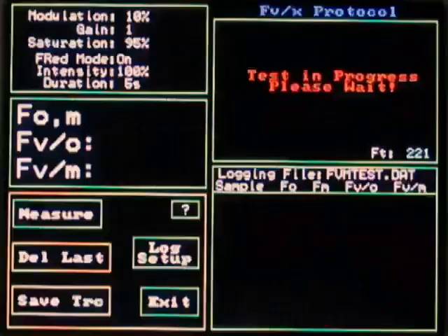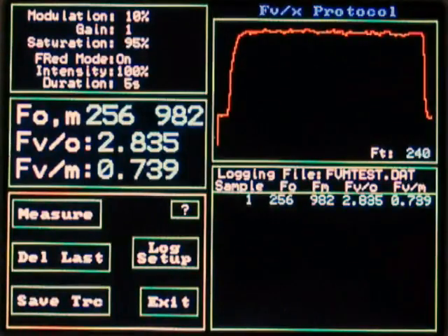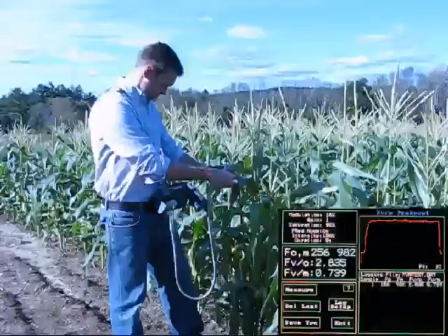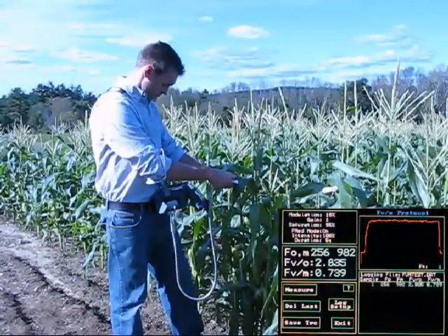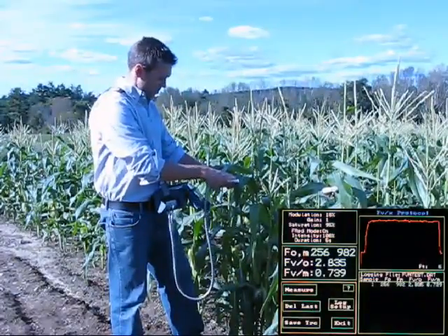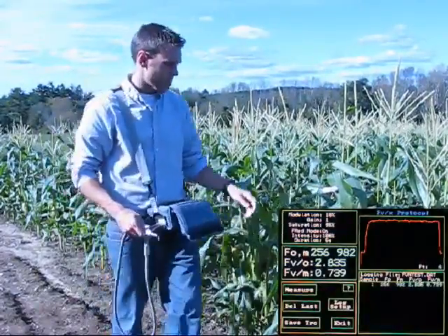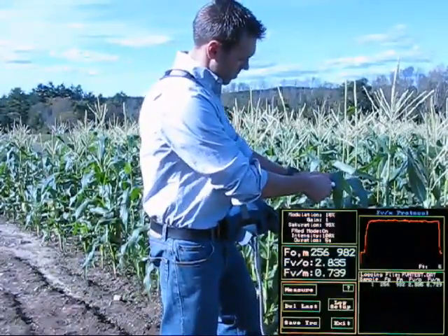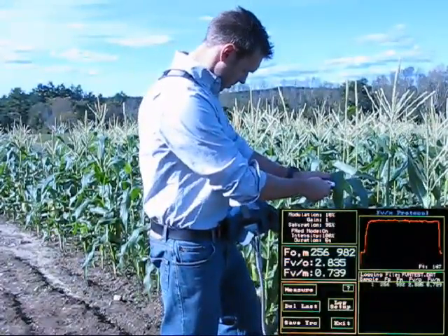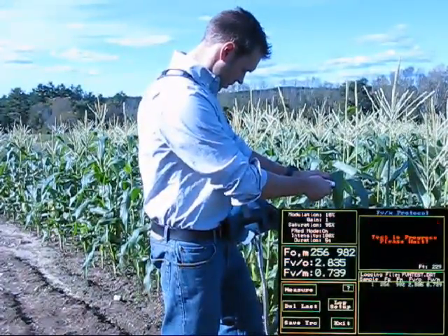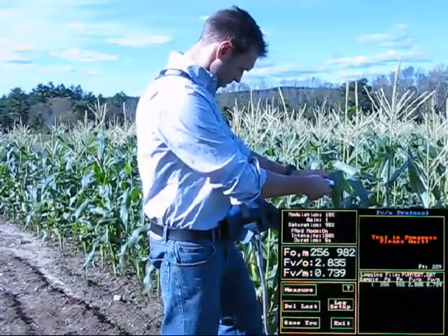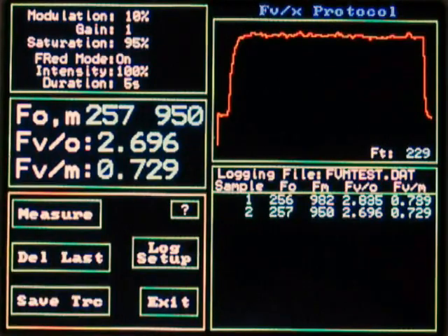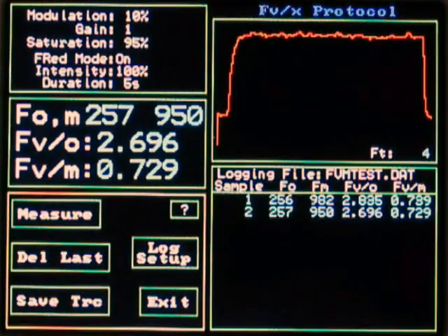Current and previous results may all be viewed from a single screen. While saturation pulse intensity and duration are adjustable, a new automated algorithm ensures the correct FM measurement is made even if the duration of the saturation pulse is set too long. This ensures that the instrument provides correct results for diverse samples such as algae and land plants.